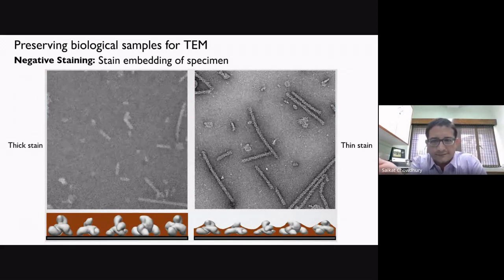So in those cases, if you just quickly do a staining, then you can see, okay, I see my protein over there. This is how it looks. And it's also very exciting for people like us, where you can actually see how the protein molecule looks, which no other technique would allow you to do, compared to conventional molecular biology techniques.